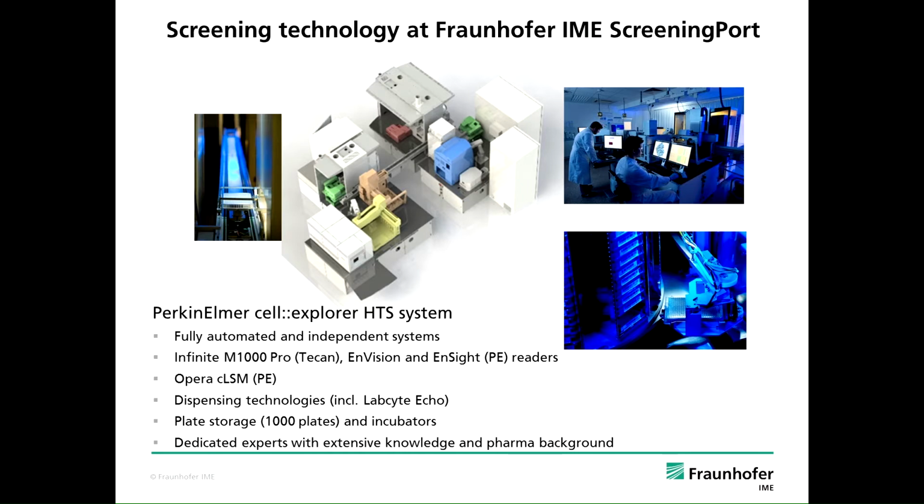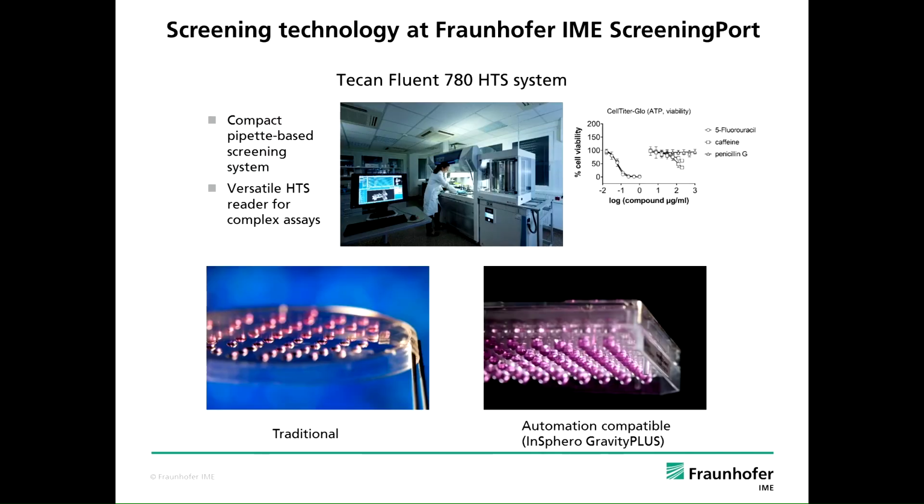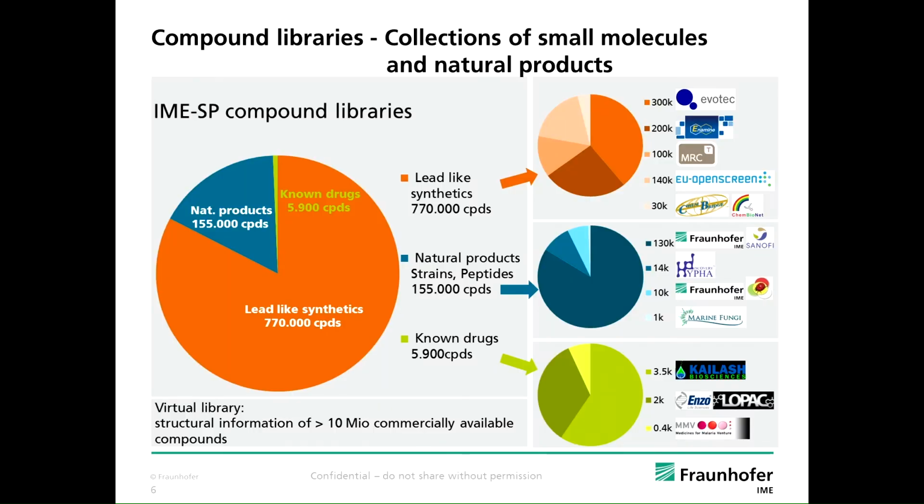The screening technology that we have in-house is basically a customized PerkinElmer system, fully automated, and we have both chemical and cell-based readouts. But we also have the technology for handling very large quantities of small molecules. Over the last 4 or 5 years, we also moved into cell-based assays for toxicity assessment, and we moved away from traditional hanging drop-based methods to more automated technologies using spheroid plates and also a TECAN system, where we can now start to manipulate 3D aggregates and try to expose them to small molecules, in particular for toxicity testing, but we can also hopefully in the future go beyond this.